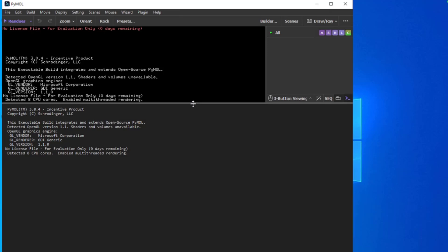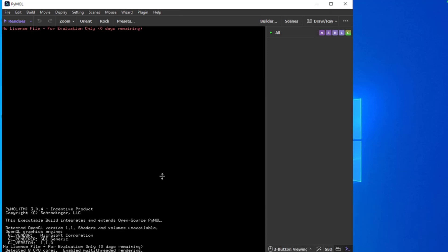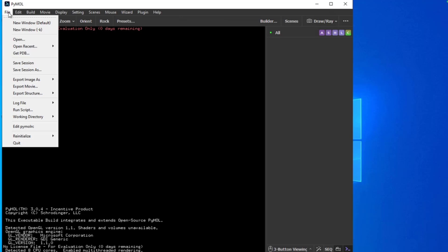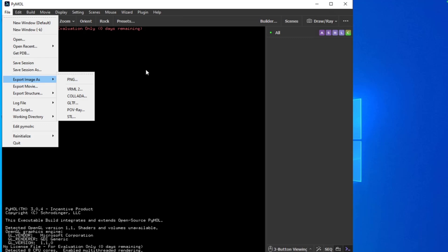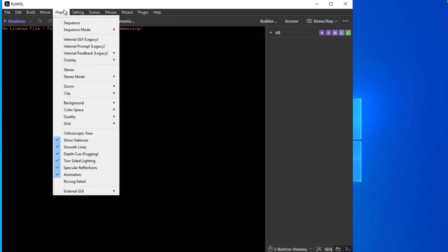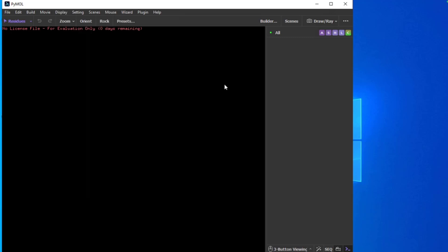Clicking on it opens PyMOL, and you can see it has the same interface as on Mac. You can go to File > Get PDB, save a session, export an image after analysis, or import files. Under Display you can change settings and configure the view however you like. Protein cleaning before docking studies can also be done here.